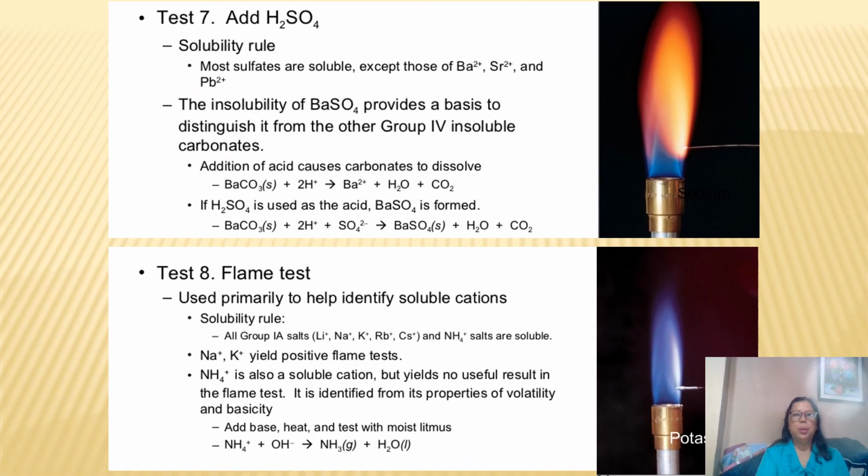When you make some tests, you can see here what precipitate is responsible for the color of the different tests. For example, flame tests are usually used for elements like lithium, sodium, potassium, rubidium, and all the salts stated here.